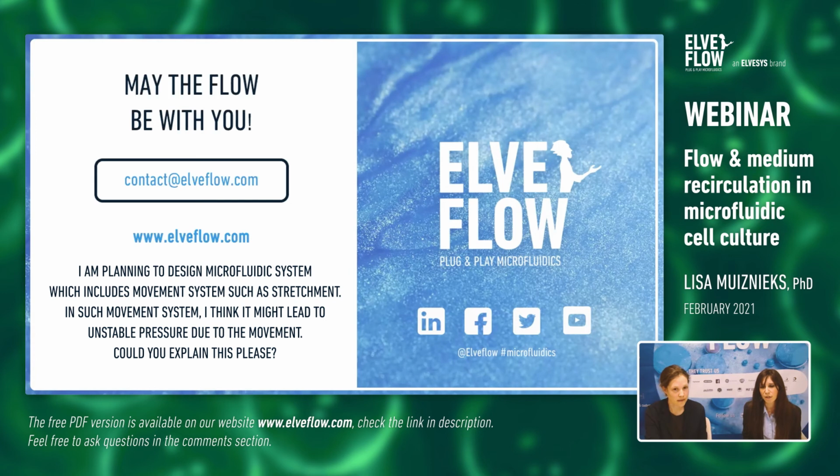And actually, we did not notice any particular problem at the level of the two fluidic channels of the chip. So you can definitely do that with some specific chip, of course, having two fluid flows and one channel of our pressure controller controlling there and applying the stretch at the level of the chip.